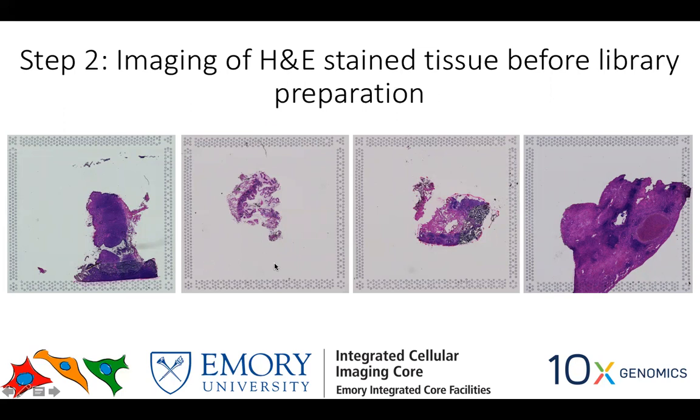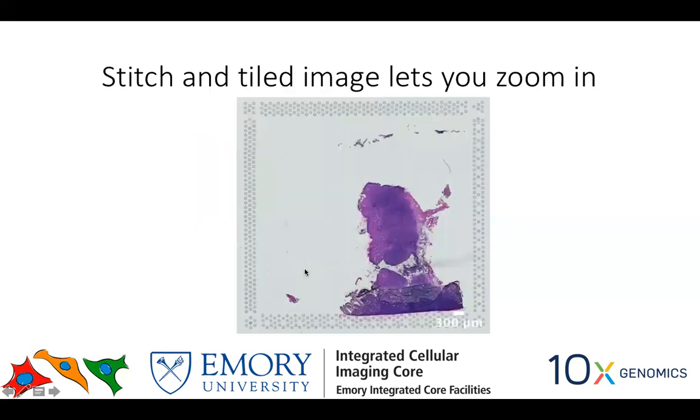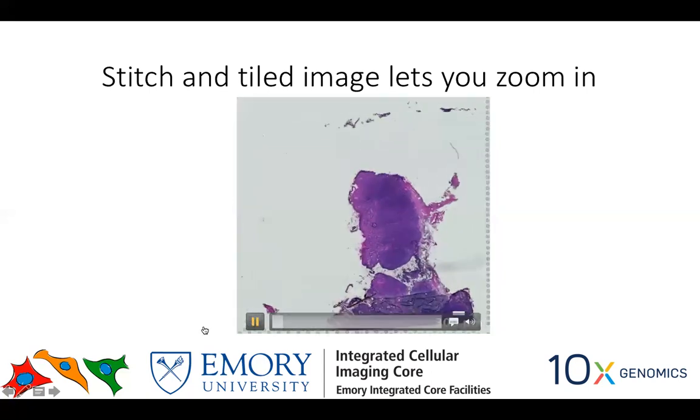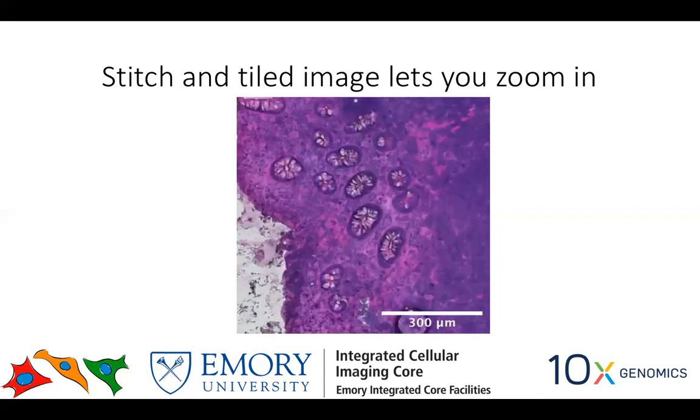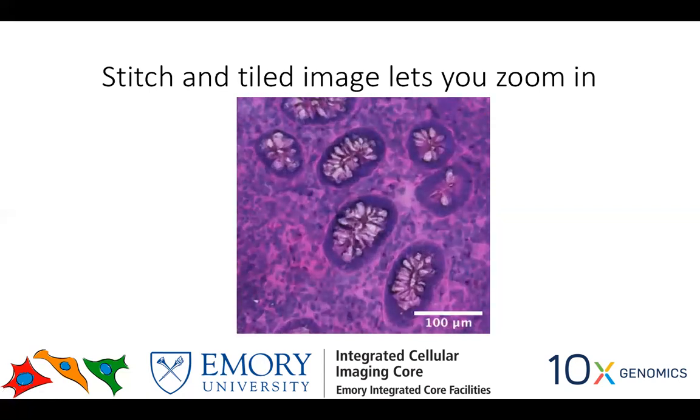I typically use a 20x objective and acquire 2 of these areas at the same time. And it's important for us to capture an area which is outside of this circular dots a little bit. Though it looks kind of small to you, when we do tiling and stitching, we can in fact zoom in onto a particular cell, right?